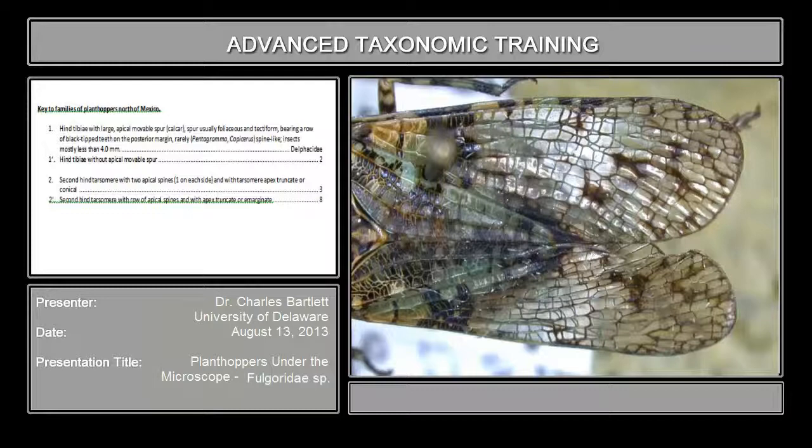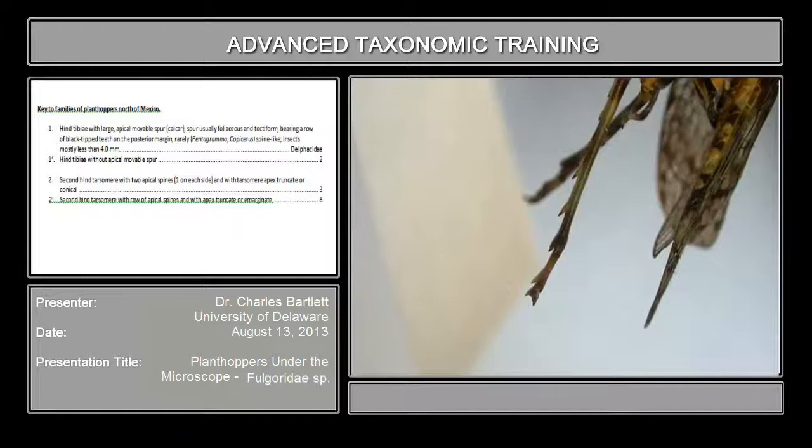We could go through the beginning of the key again, but this specimen will key in the same sequence of steps we just saw with the dictyopharid. Once again, here's the hind tibia, first tarsomere, second tarsomere, which bears a row of spines — so the hind tibia does not have the apical spur.